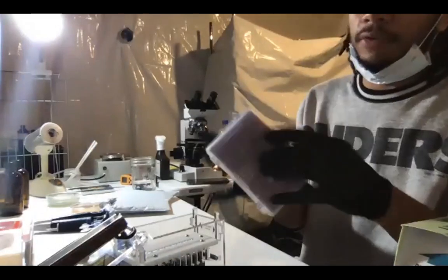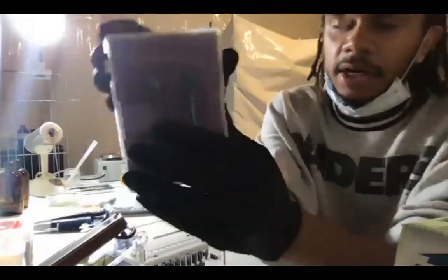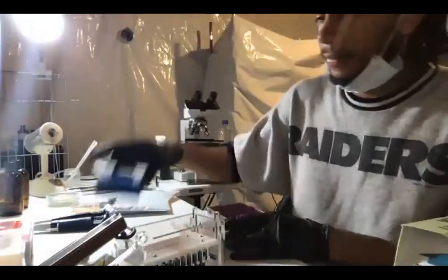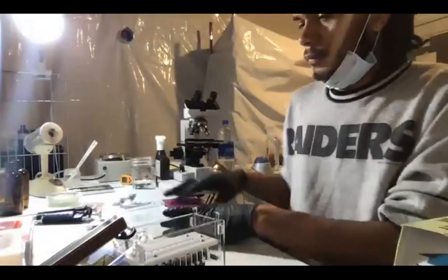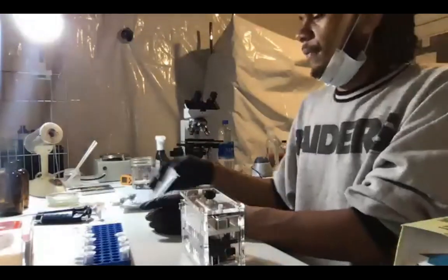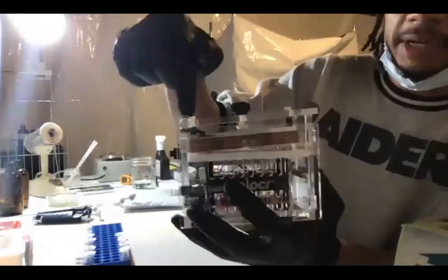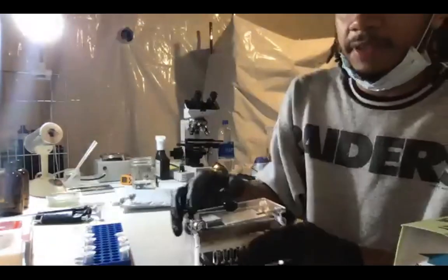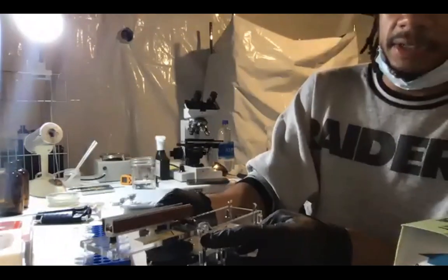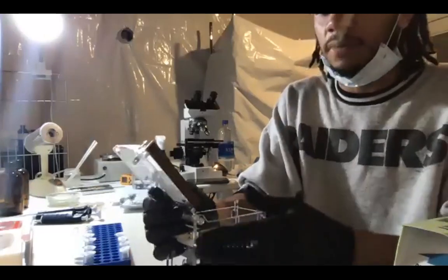Or whenever you run out of the 10 microliter tips, you can just use this to hold your PCR tubes, instead of buying a whole rack for it. But I'm just gonna do it right into the PCR. So the way that I do it is that from this side, from the hinge, that's my number one, because it's really hard to write on the tips of these mini PCR tubes. So I just always remember that this is number one and then this is number eight. So figure out the best way to organize this for yourself. That's what works for me.